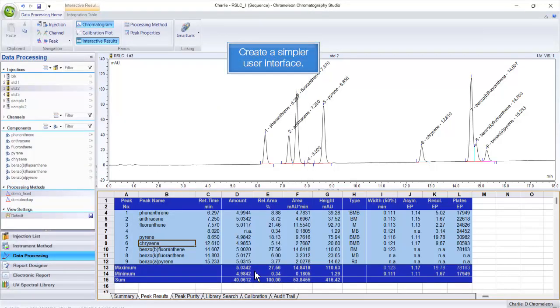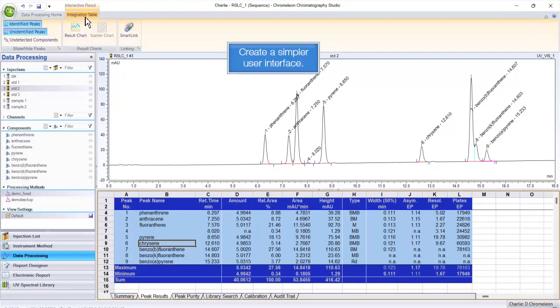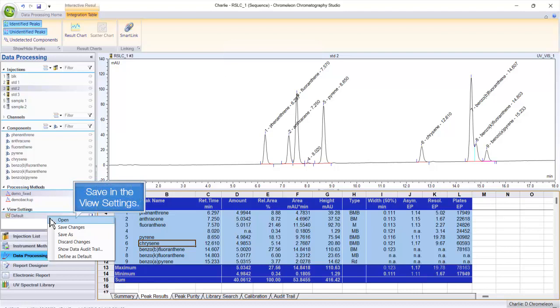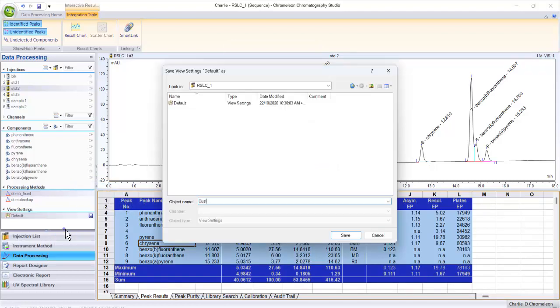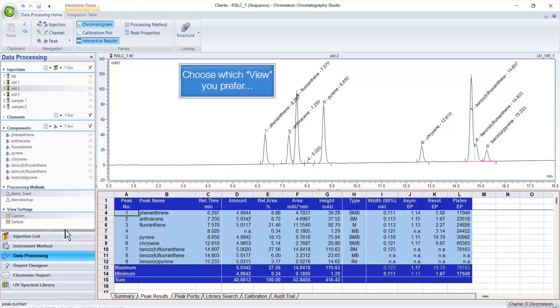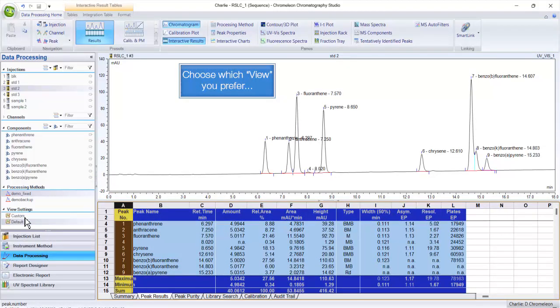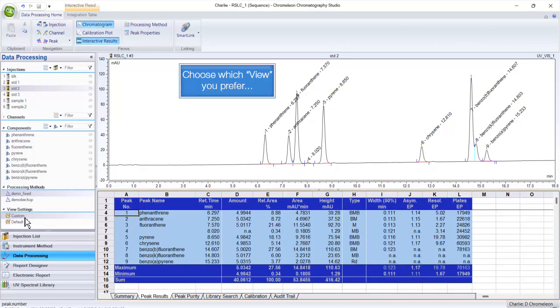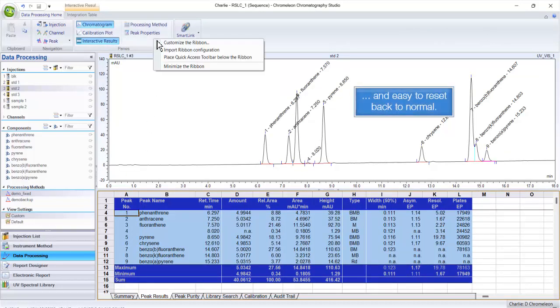Create a simpler user interface. Save in the view settings and choose which view you prefer. It is also easy to reset back to normal.